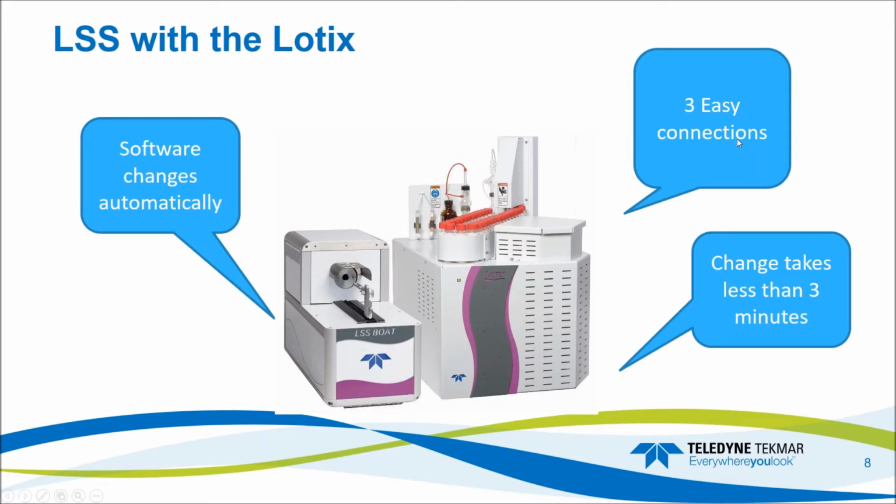Now there are 3 easy connections to hook up the Lotix to the LSS boat. There's one that you only need to do when you first install it, and it's you actually cut into the pressure line into your water reservoir. Since it's a positive pressure instrument, we use positive pressure for the water reservoir, so you cut into that, and that provides backflow, which I'll explain more later.